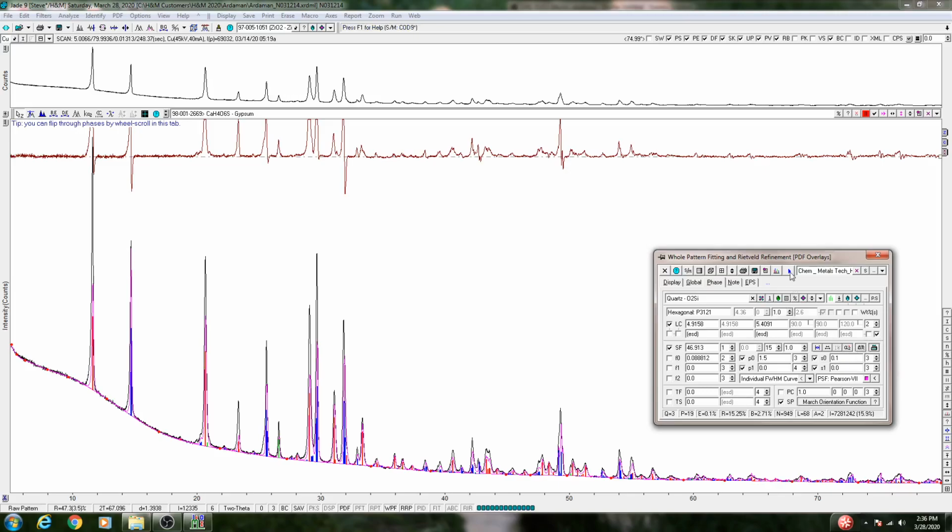Now this is our button to actually perform our Rietveld refinement. We will leave all these checked. These are also profile parameters. This is the Lorentzian portion of it, and then this is skewness and asymmetry, which we're not really going to talk about, just rely on the default. We did briefly mention in the slides various types of profile fits.